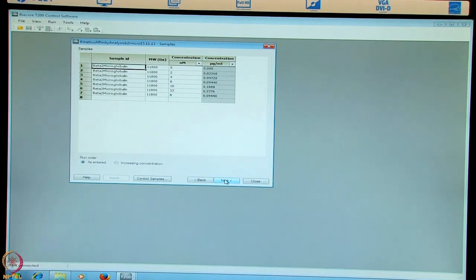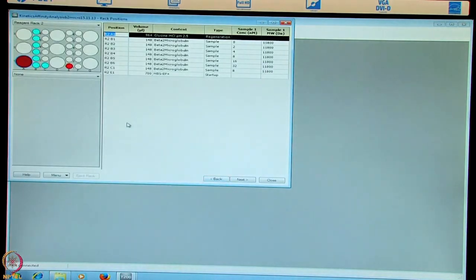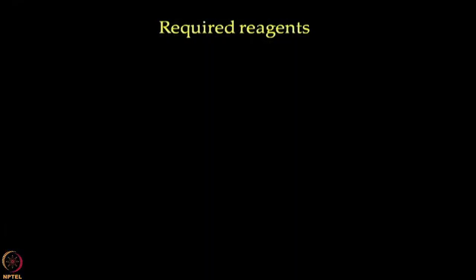We say next. And prime before run is highlighted. Now we have the rack positions this way. We have regeneration buffer here. Startup here with the samples here.